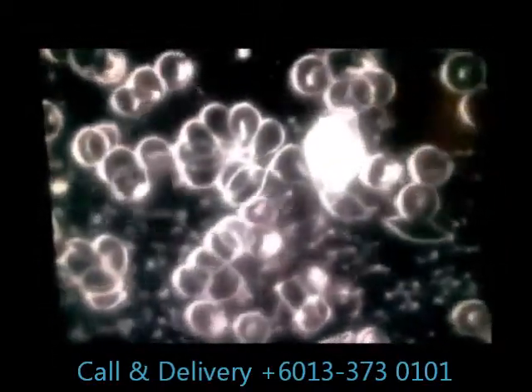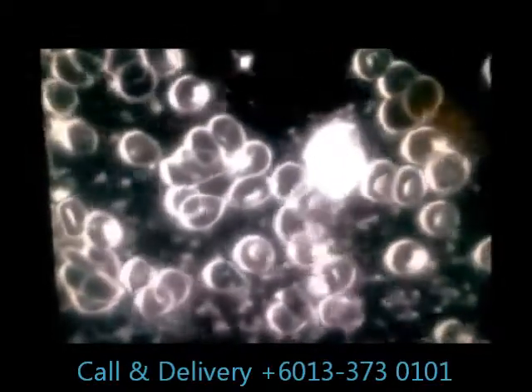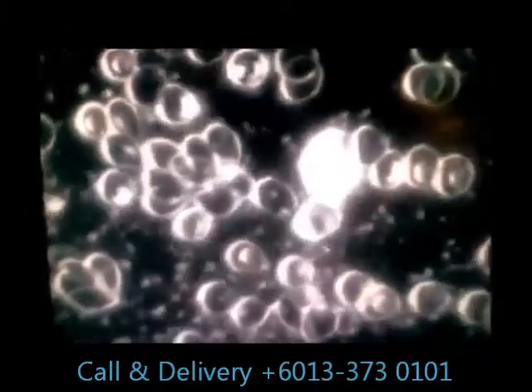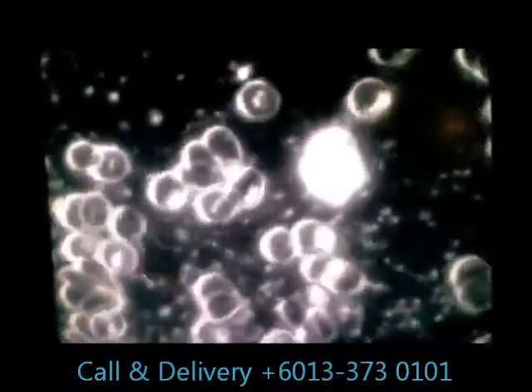The big white glob there in the center is a white blood cell. Looks a little small, not really formed very well. So this lets me know that this person is probably very acidic, not digesting food very well.